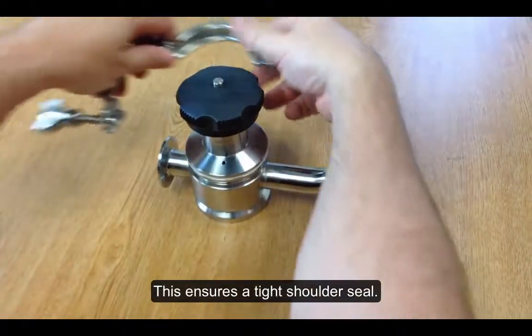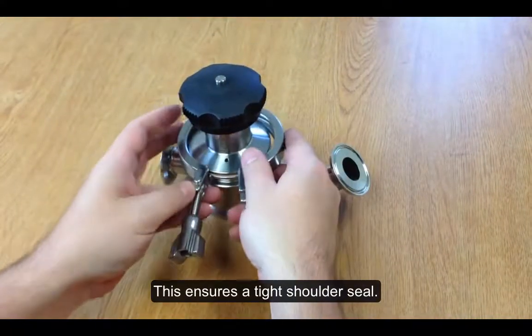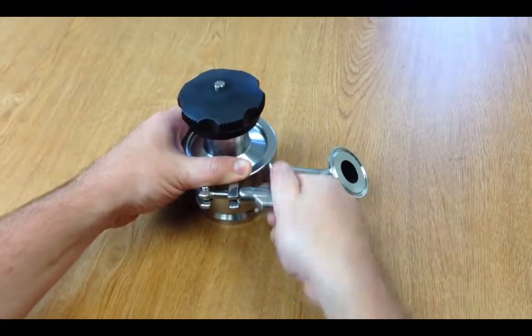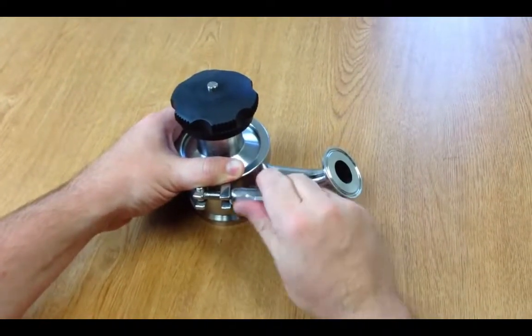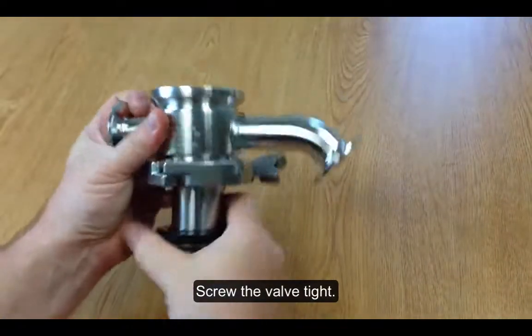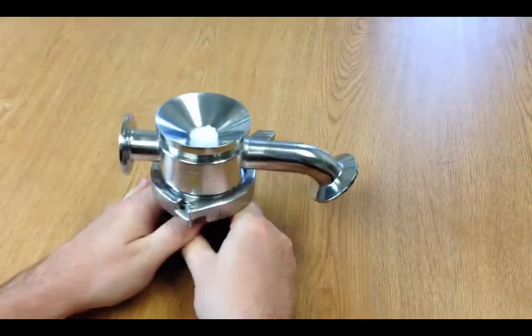You'll want to do that because it ensures a tight shoulder seal. Then you'll reinstall the clamp and close the valve. That's how easy it is.